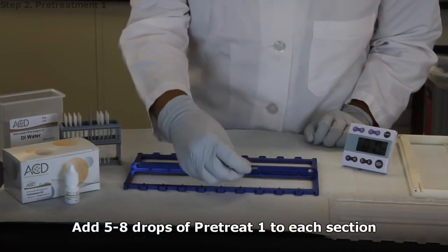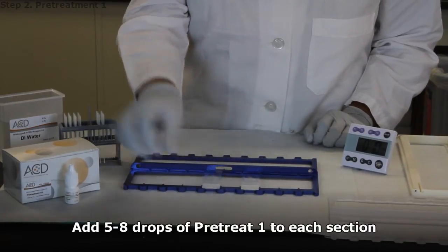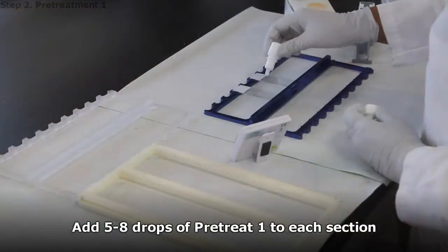Lay the slides on the bench and add 5 to 8 drops, or enough volume to cover the entire section, of Pre-Treat 1 to each section.